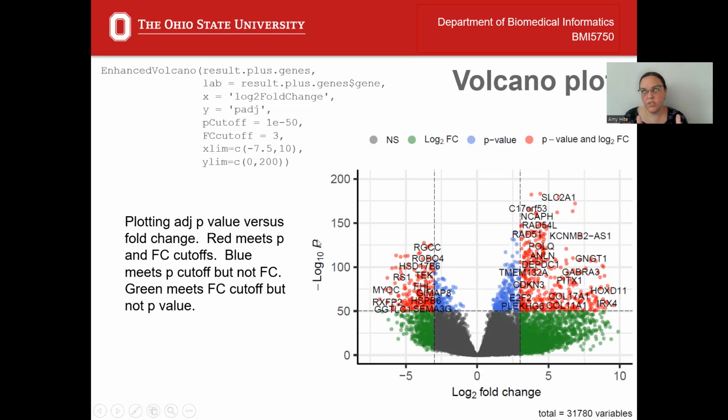And we use the adjusted p-value here because that is the better option. So we are taking the adjusted p-value and applying a log 10 transform of it. And since it's the negative log 10 of our very small number, the smaller our p-value, the larger the negative log 10 of that p-value.